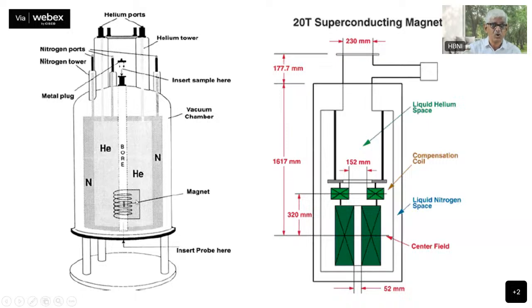Okay, you cannot see this coil because this coil is sitting in the magnet. Your sample is sitting outside. You can lift the sample in and out, but the coil cannot be changed. It remains inside here. So this is helium there, and then outside the helium tank there is also a liquid nitrogen tank. Okay, why is this liquid nitrogen tank required?